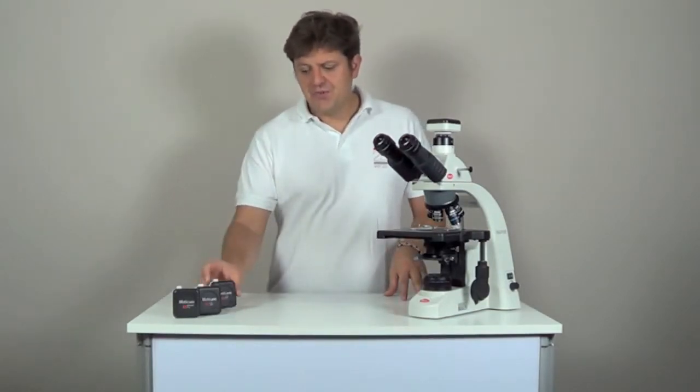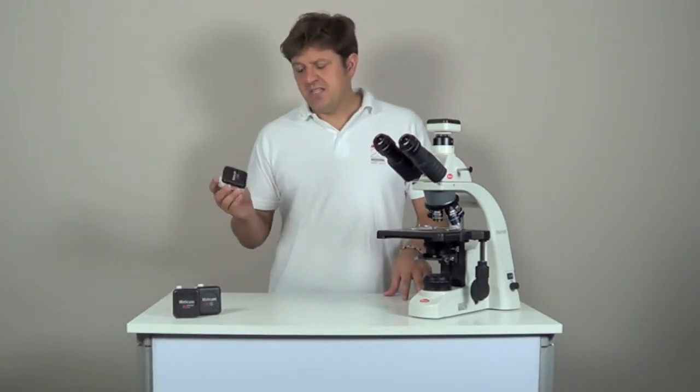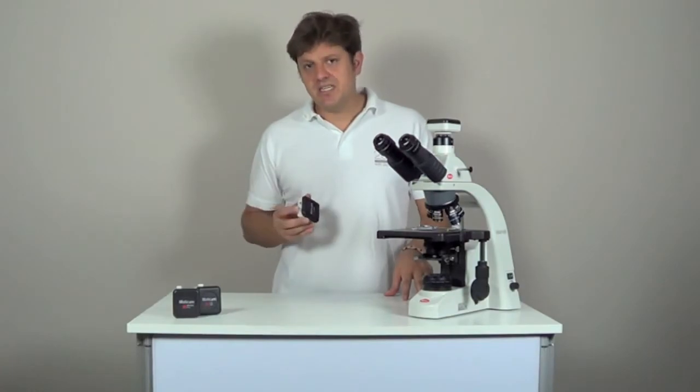And Maticam 2 has a resolution of 2 megapixels, so in this group it is the camera that gives you the most details.